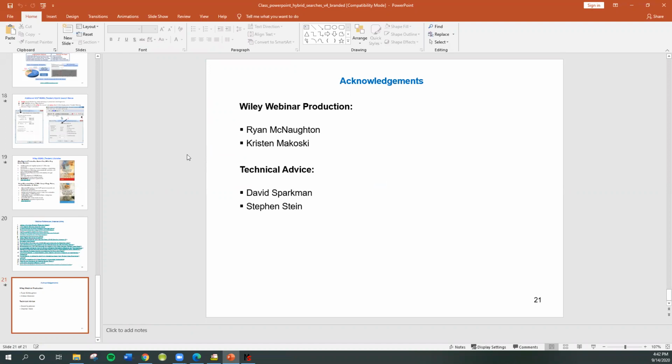I'm still here, and thank you for running through that with us, and thank you for the acknowledgements. With these last couple of minutes, I'd like to run through a couple of our frequently asked questions. And the first one is, how well do you think the hybrid search will work for unknowns?